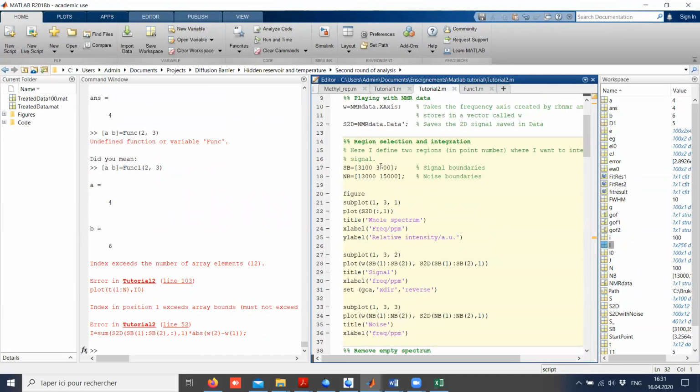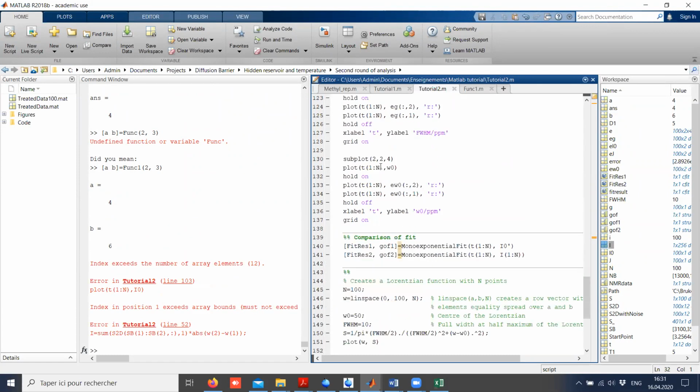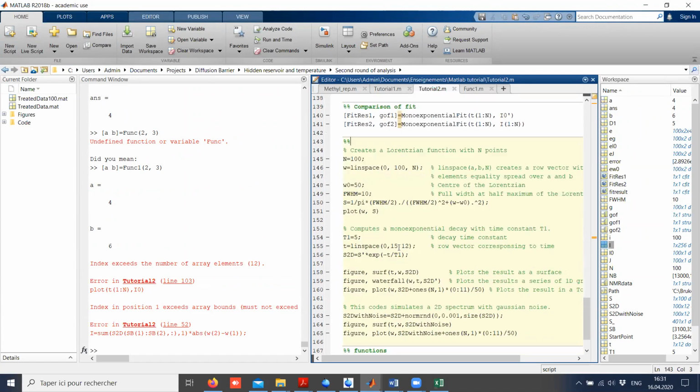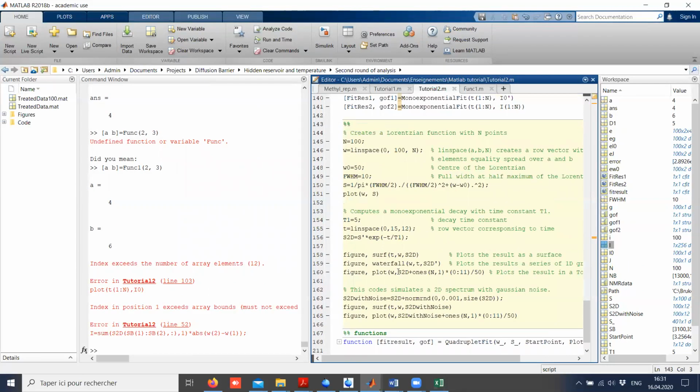I have to run everything again. Okay, I'm not going to do that. If you recall the data, they were noisy and the decoupling was moving, the central frequency was moving, so I cannot do what I'm going to do now on the simulated spectrum. This is because it was a dissolution DNP experiment, and some of the parameters are not very stable. But in a more conventional NMR experiment, you can do what I'm going to do.